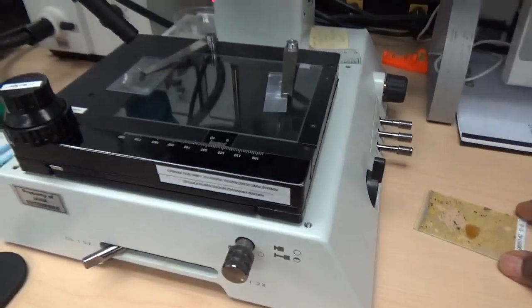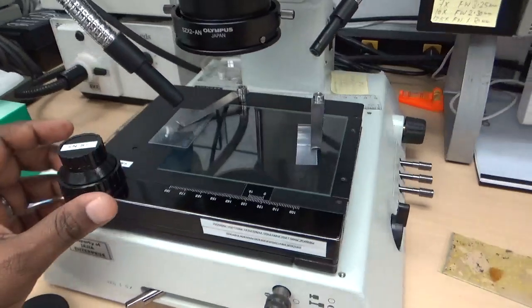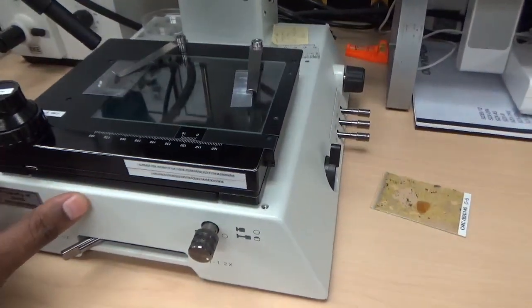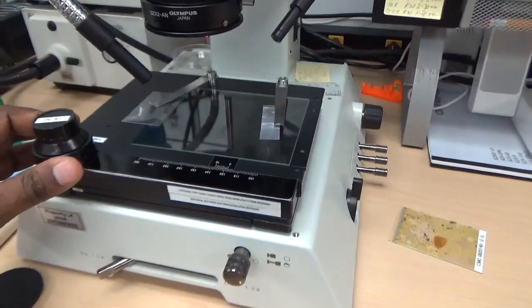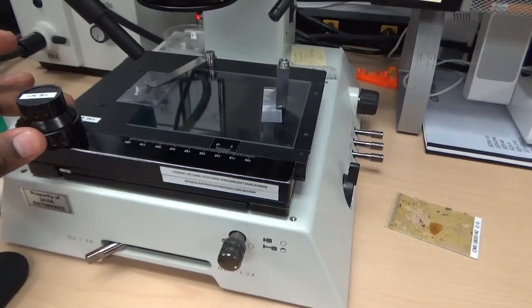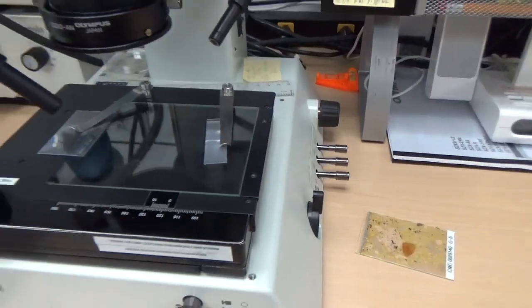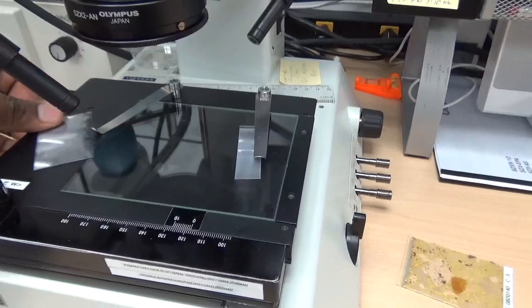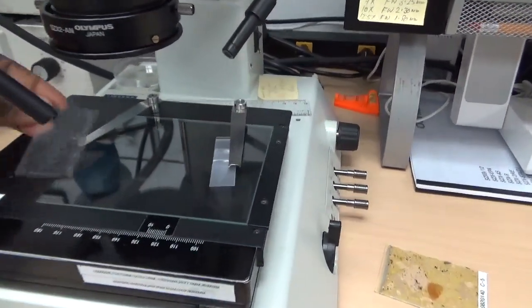We attach a manual XY stage at the base of the microscope. This stage is glued to the transmitted light base with double-sided tape so the stage doesn't move. And we use these sample holder clips to attach to a transparent ruler on both sides.